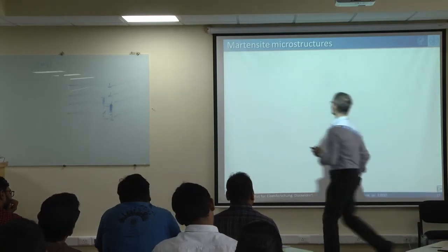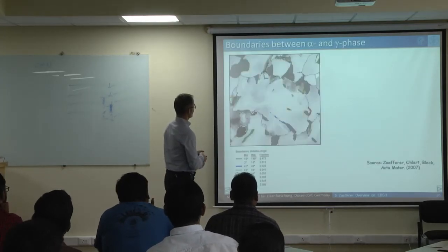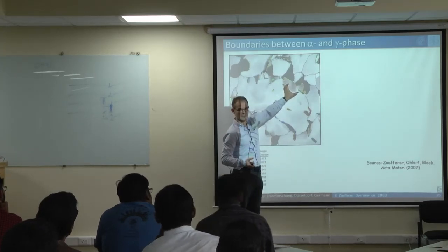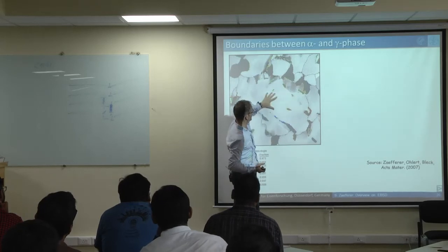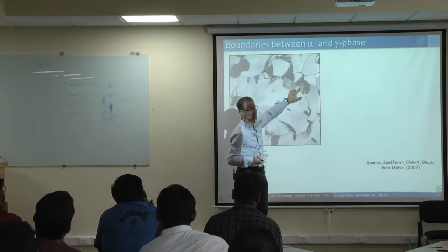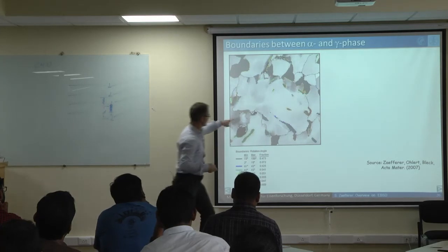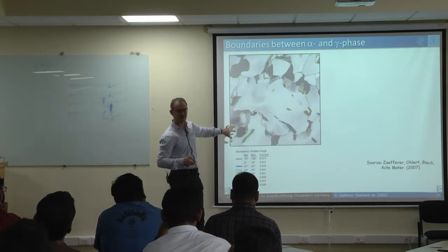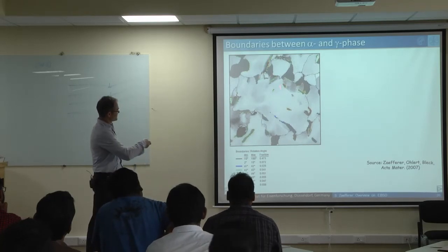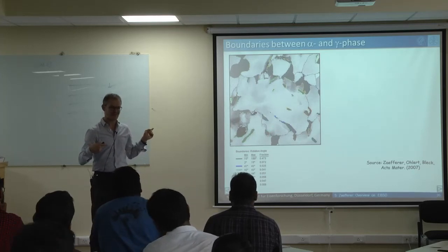Here, in this case, which I showed you, where was it? This one here, it's pretty clear. This is bainite, because the bainite is globular here. That cannot be a martensite. But this is actually a bainite which is directly connected to the surrounding ferrite. So also here it was difficult to find the bainite. You find the bainite only because it suddenly makes this sudden transformation of misorientations. That was the way to determine: here's a bainitic area, here's a bainitic area, here's one. The transformation is not so clear in this case.